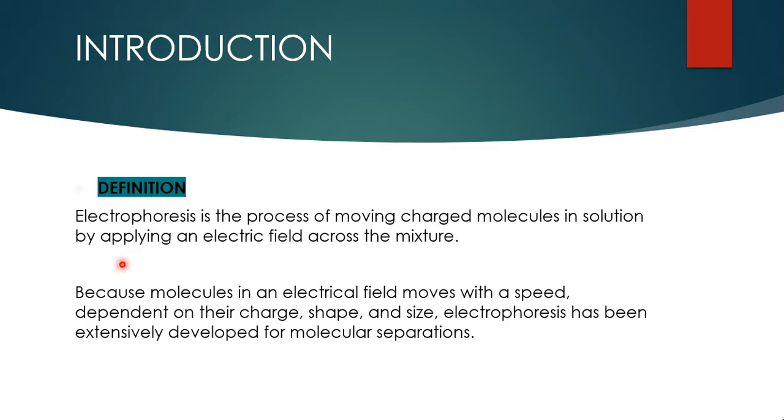This electrophoresis technique was first invented by Mr. Tiselius in the year 1937. Why did he do it? Because molecules in an electric field move with a speed, obviously depending upon their charge, shape, and size. All these things have a major impact on the mobility of these molecules. So electrophoresis has been extensively developed for molecular separations. What do you mean by molecular separations? Your DNA, RNA, proteins, all those things can be separated very easily by using electrophoresis.